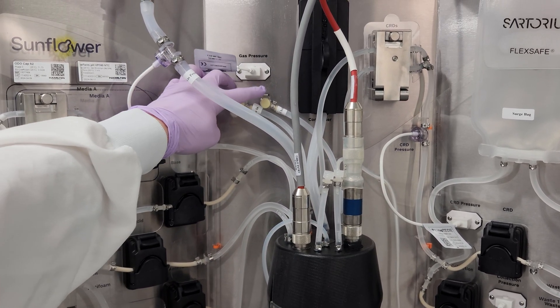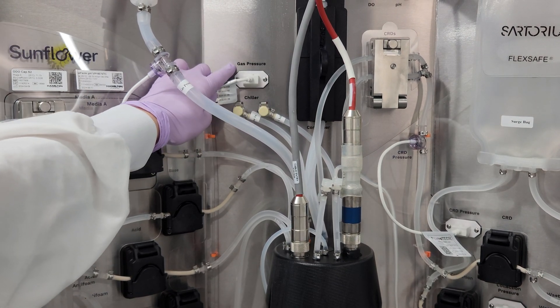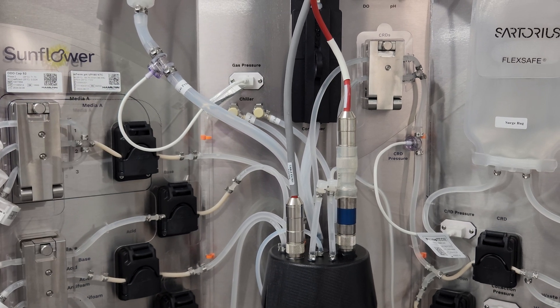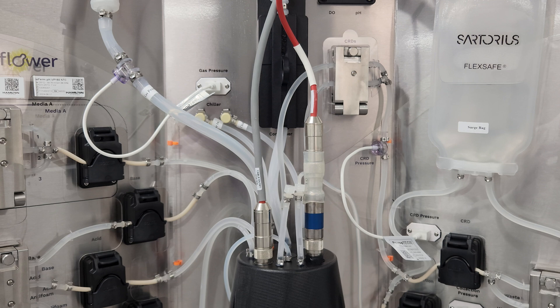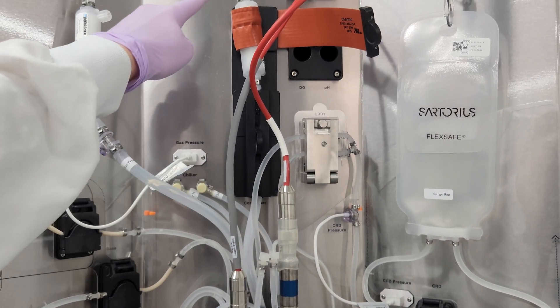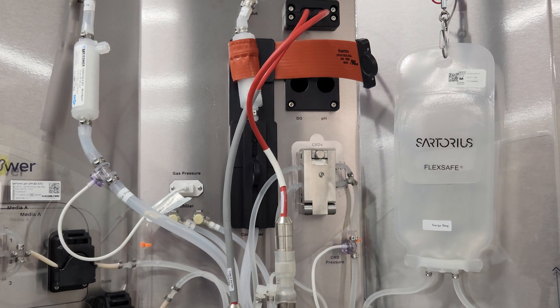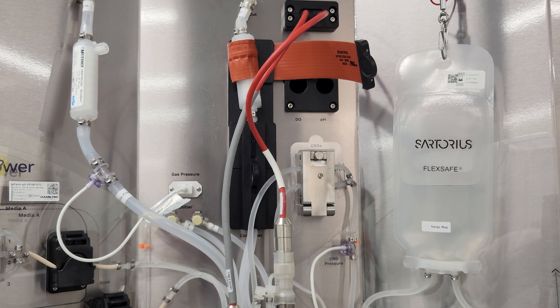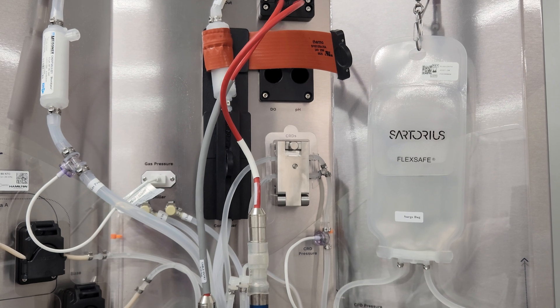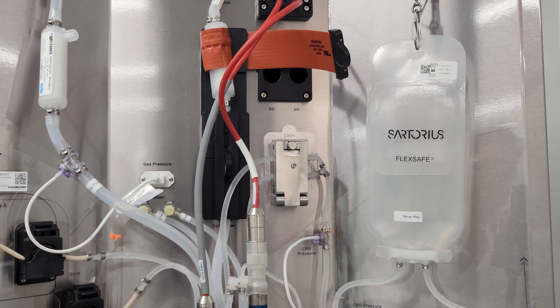Up here on the panel, we have connections to circulate fluid from the chiller through the temperature control loop inside the vessel and a gas line pressure port for monitoring the bioreactor headspace pressure. This sensor is located within the air inlet line. Gases exit through the exhaust line near the center of the bioreactor head plate, which is held inside this condenser and gas line outlet heater in the center of the panel during operation. These components prevent condensation from entering the off-gas analyzer inside the Daisy Petal, which measures the concentration of oxygen and carbon dioxide in the exhaust air — direct indicators of microbial respiration and metabolic rate.